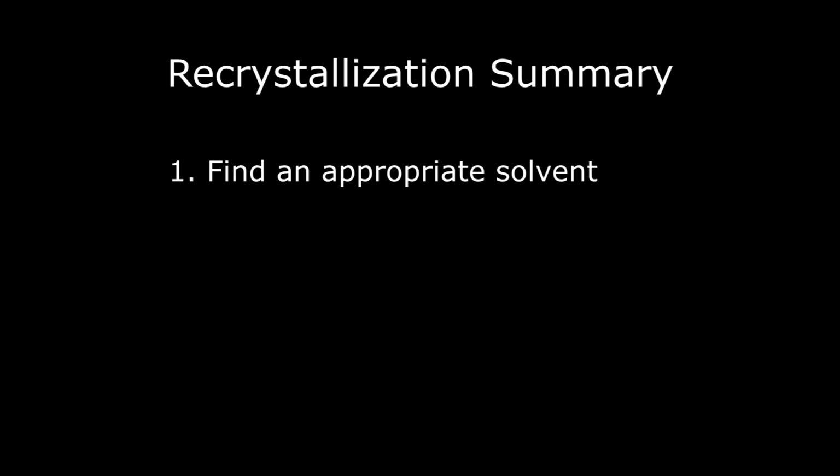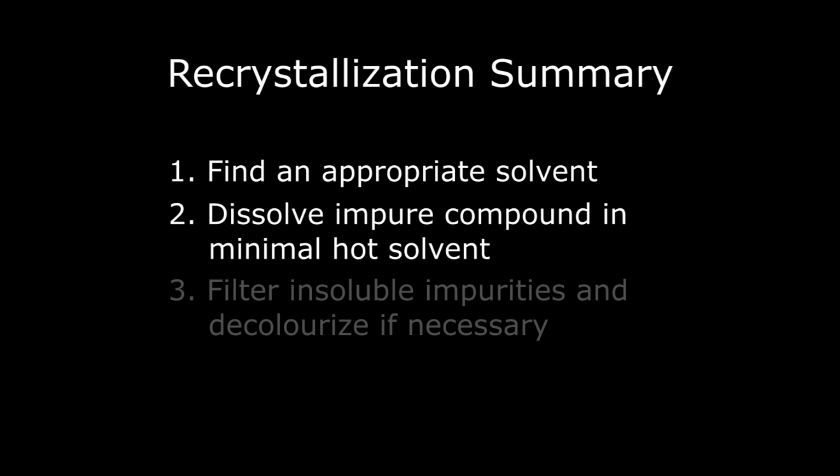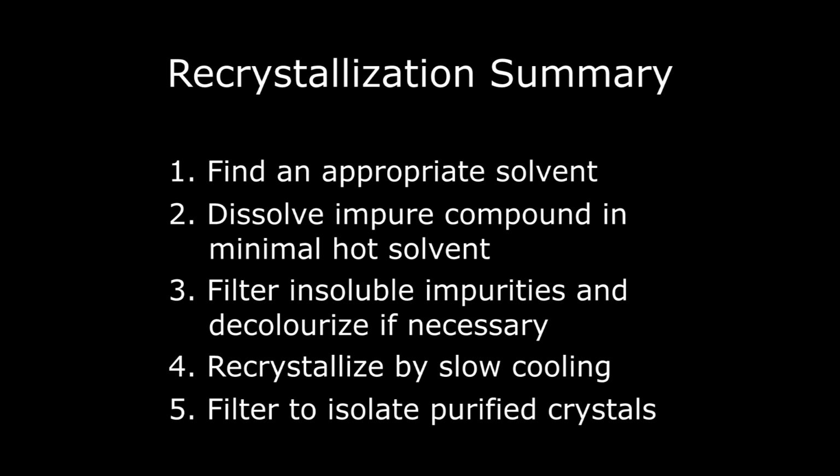To briefly review, here are the steps of recrystallization. Find an appropriate solvent. Dissolve impure compound in minimal hot solvent. Filter insoluble impurities and decolorize if necessary. Recrystallize by slow cooling. Filter to isolate purified crystals.